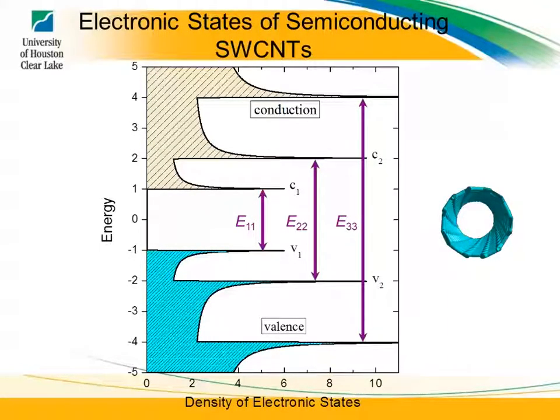But we could look at different nanotubes by using different laser wavelengths. And all of the semiconducting nanotubes, which is about 2/3 of all nanotubes, fluoresce. So you won't see this for metallic nanotubes, but you will see it for the semiconducting ones. Does that answer your question?